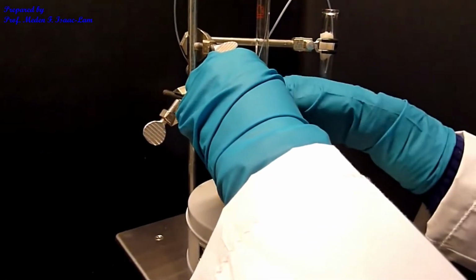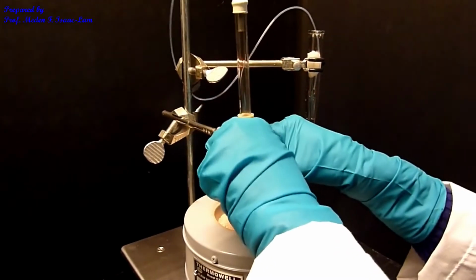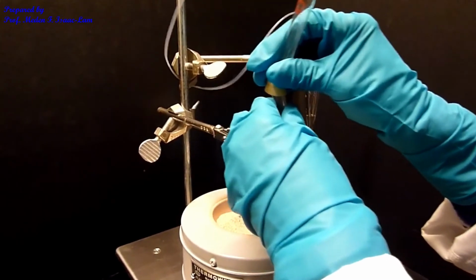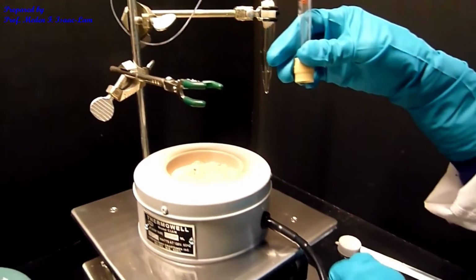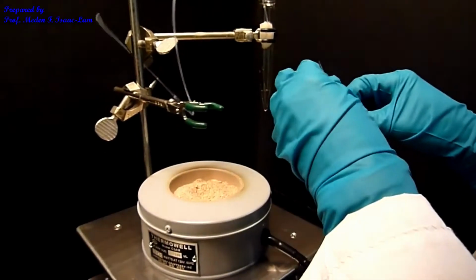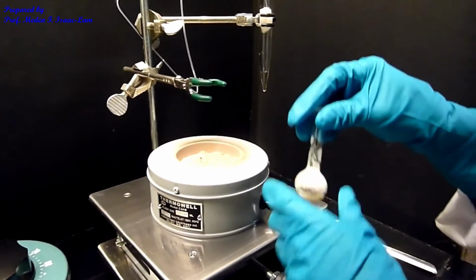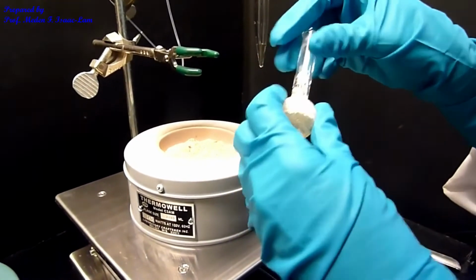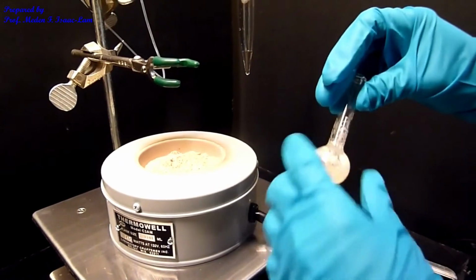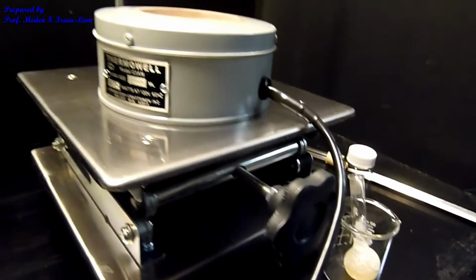Okay, I will now take out the setup. And I will allow it to cool. The next step is to filter.